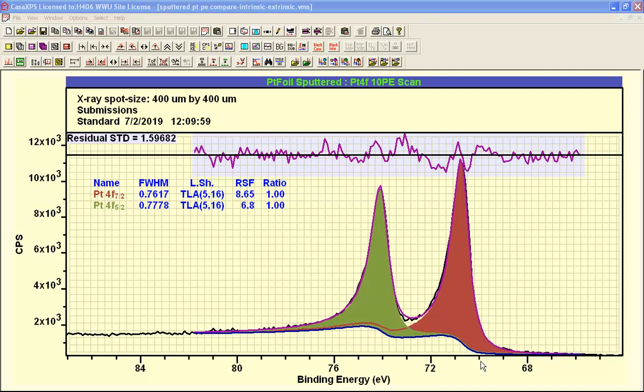Now, while the functional form for a background may integrate to infinity quite happily, you can understand why that might be the case. In the case of a photoemission peak, we should be able to calculate an intensity that we can use in quantification. So an infinite area line shape is of little value when quantifying data by XPS.